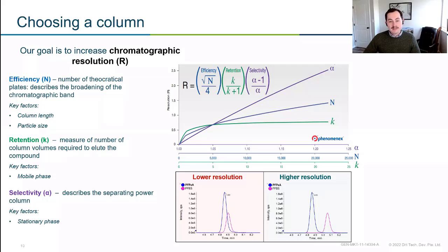With MS-MS, this is not as important as, say, UV. With UV analysis, if our peaks were superimposed, there's not much we can do in terms of integration and quantification. We really need to separate them. Whereas with MS-MS, we can kind of get away with this a little bit. But regardless, we're always trying to keep separation between our peaks. And the variables that we use to do this, one would be efficiency. So efficiency is the number of theoretical plates and kind of describes that chromatographic band.